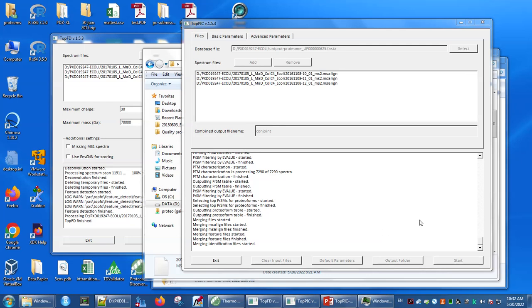So it might be that we detected 500 proteoforms in one, 500 proteoforms in the second, and 500 in the third, and yet cumulatively, that's not likely to be 1,500 distinct proteoforms. There's, generally speaking, especially in this case where we have 3 technical replicates, a huge degree of overlap in the proteoforms represented by each experiment.